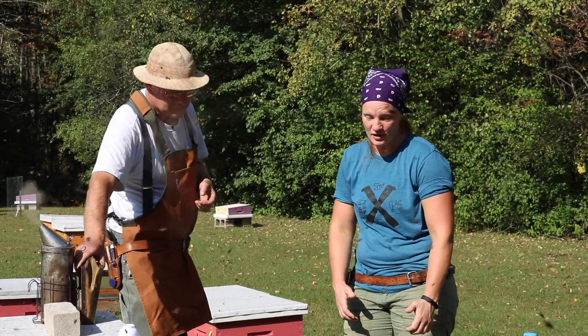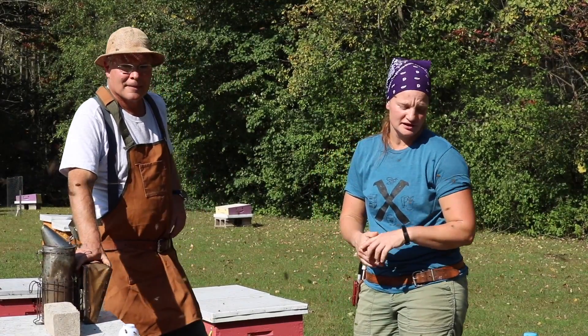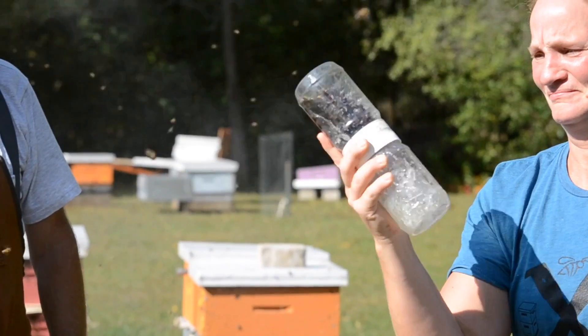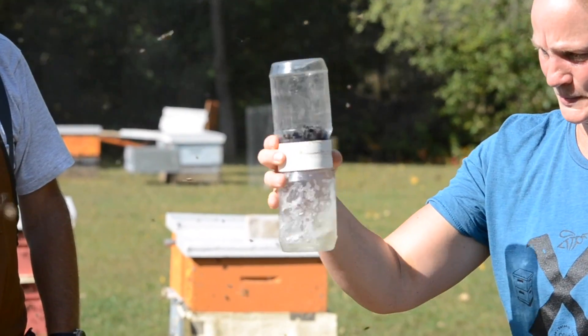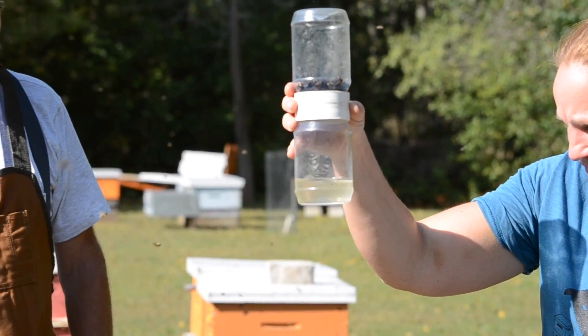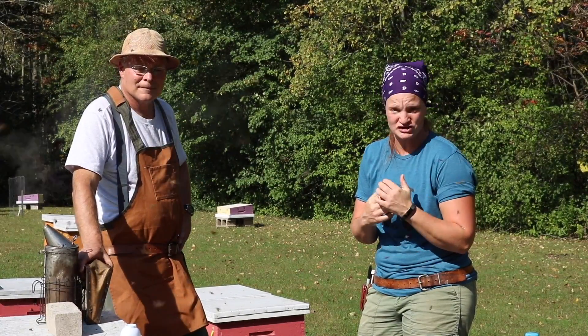The alcohol wash is a great monitoring method. It works very well and unfortunately that's because it kills both the bees and the varroa mites. The varroa mites are holding on to the adult bees with their little feet. They can hold on quite tight, and so when you want to look for levels of infestation and you're taking a sample of bees to do that, the mites will stay holding on unless you can kill them — and unfortunately to kill a varroa mite you're probably also going to kill the bees.